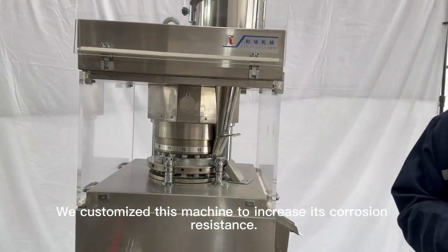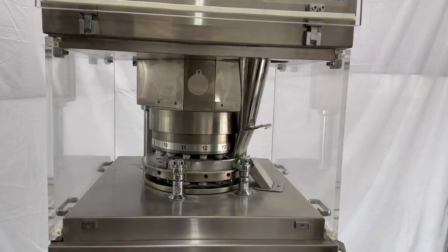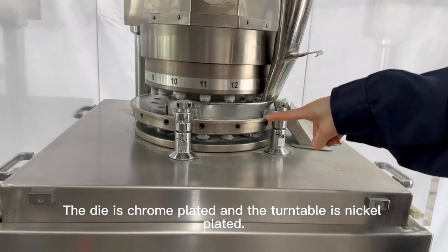We had customized this machine to increase its crushing resistance. The die is chrome-plated and the turntable is nickel-plated.